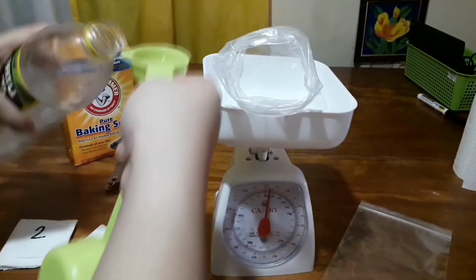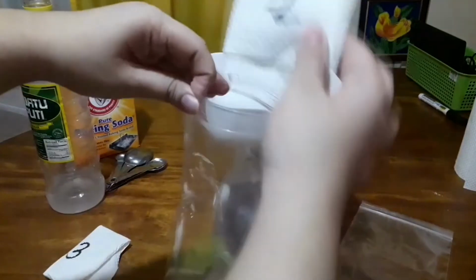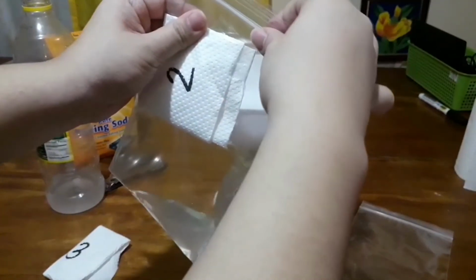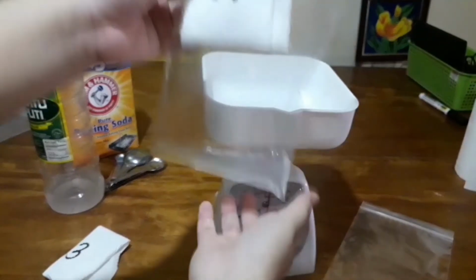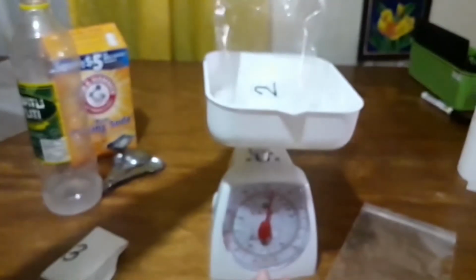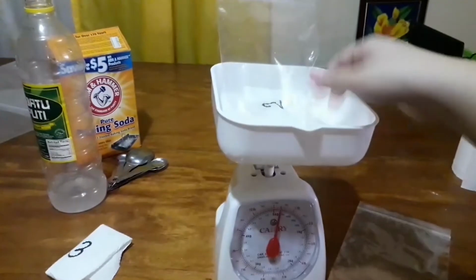We will be using 50.5 ml of vinegar, 10.5 grams of baking soda, and a medium-sized Ziploc bag. Similar to Miss Bea's trial, we must create a packet containing 10.5 grams of baking soda. Pour 50.5 ml of vinegar in the bag. The total measurement before the reaction is 61 grams. Put the packet inside the Ziploc bag and seal properly. Let us observe and measure the mass after its reaction. As the scale indicated, the mass after the reaction was still 61 grams.